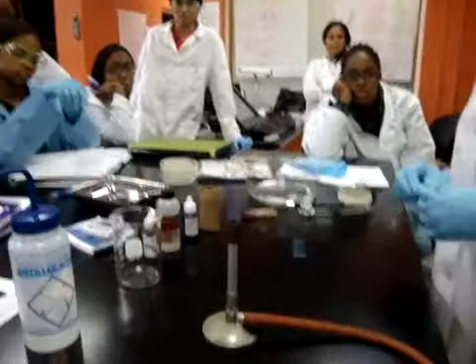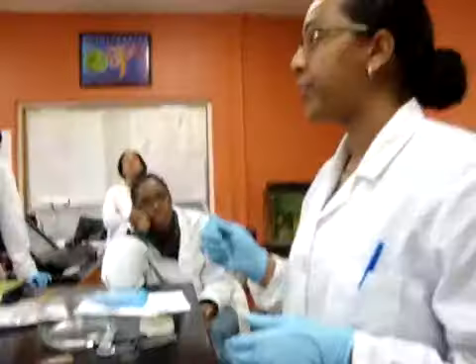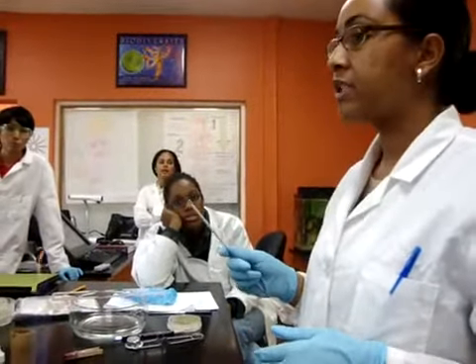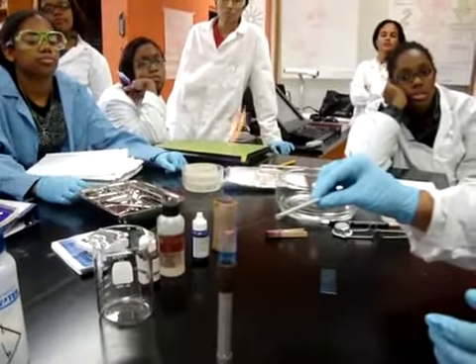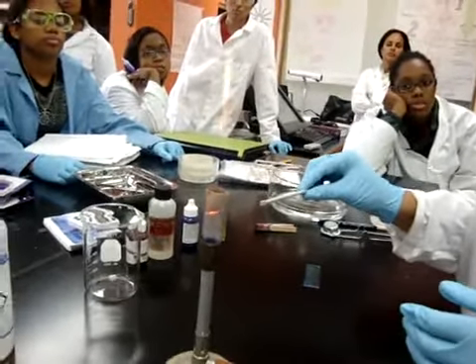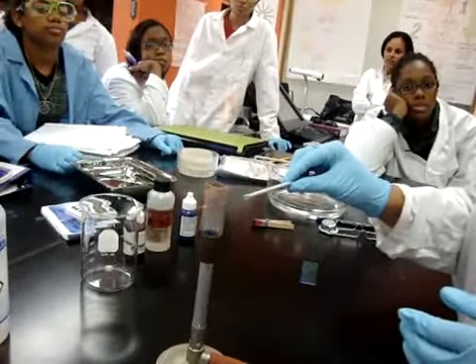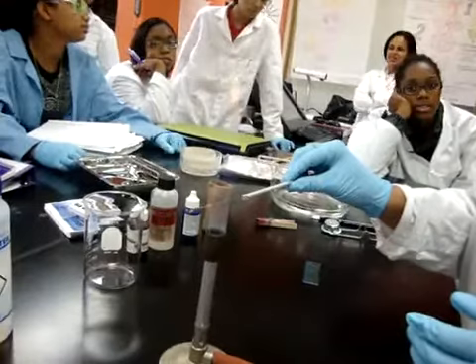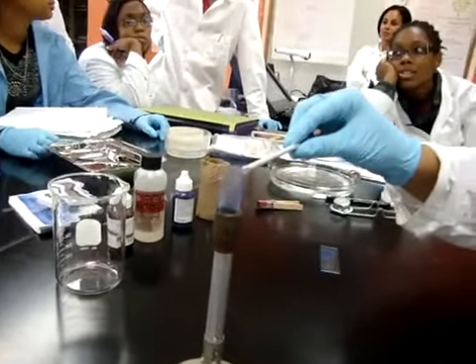Okay, to prevent contamination between every application of bacteria, you're going to burn your loop. And you're going to burn it until it turns red. So when I put it in, I'm going to hold it there until it turns red. And I'm going to burn it all the way up the entire wire. And you're doing that for what reason? To sterilize. You did this when you sterilize your baby's bottles, right?